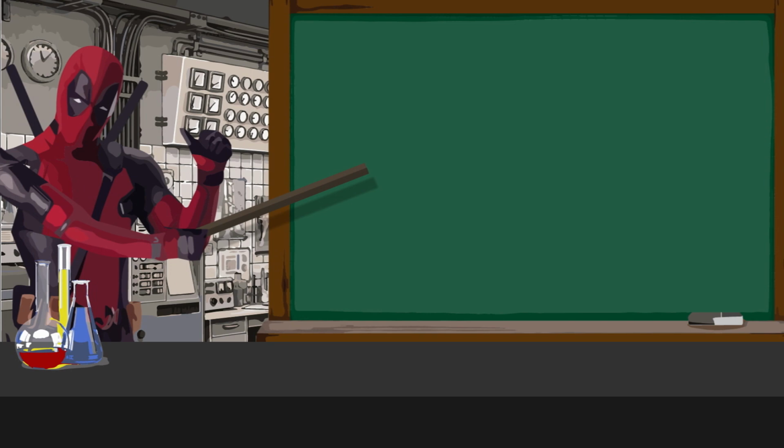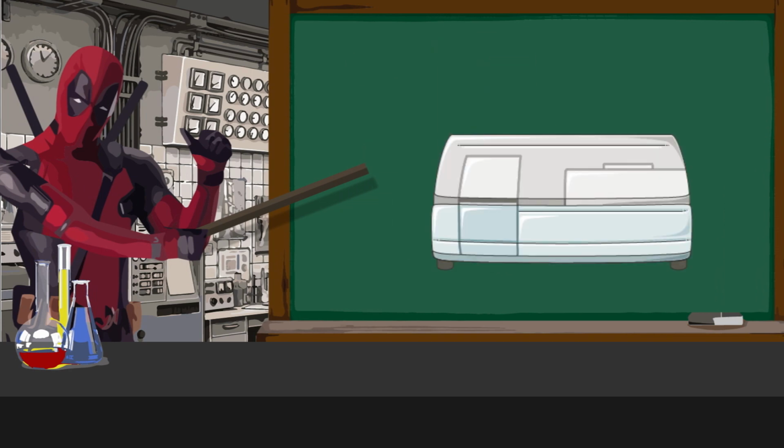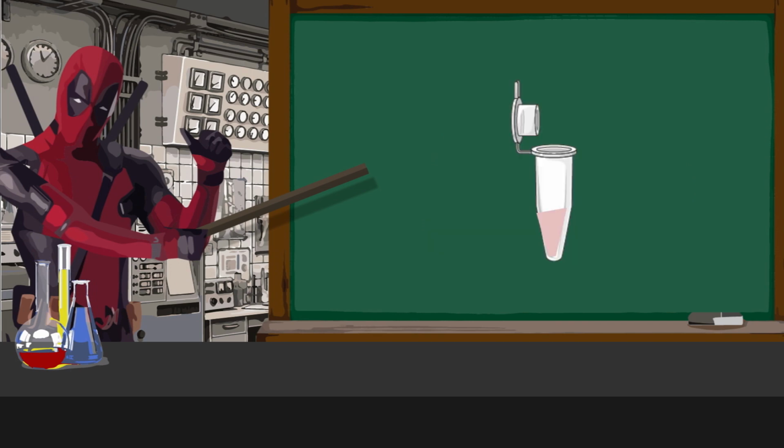You then transfer it to the shaking incubator, and it will be shaking for 1 hour, while you also measure it every 20 minutes. From there, from the 12 milliliters from the first step, you remove 100 microliters and transfer it to a microcentrifuge tube, and then you spin it for 2 minutes. After the centrifuge, you remove the supernatant.